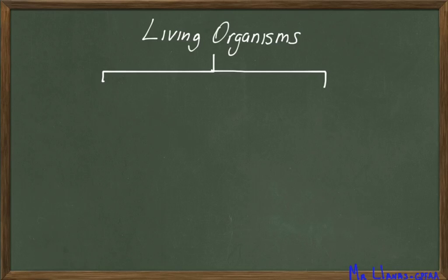Hey guys, this video is going to be an introduction to prokaryotes and eukaryotes, as well as looking at cells under the microscope and identifying different parts. Okay, so let me pull up the thinking map so we can go over it real quick.